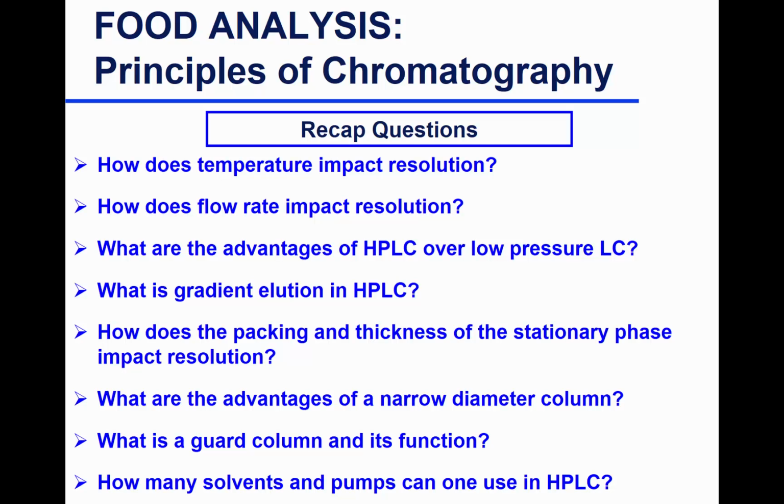That is correct. So like we said with HPLC columns, they're more packed, so you have less void or free space. But also if you have a hollow tube, like capillary tubes, they have some in HPLC, but they're most common in GC. You have a thin layer of stationary phase. That means your solute doesn't have a lot of time to go in and wander. It would come out faster and equilibrium would be reached faster.